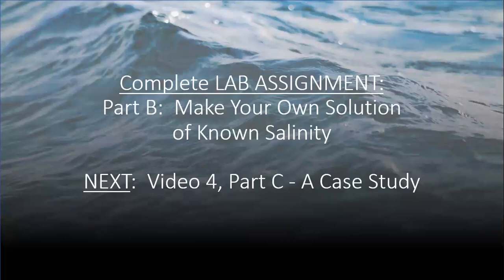It's now time to complete your lab assignment. For Part B, make your own solution of known salinity. Next, watch video 4, Part C, a case study. Again, please address your questions to your lab TA.